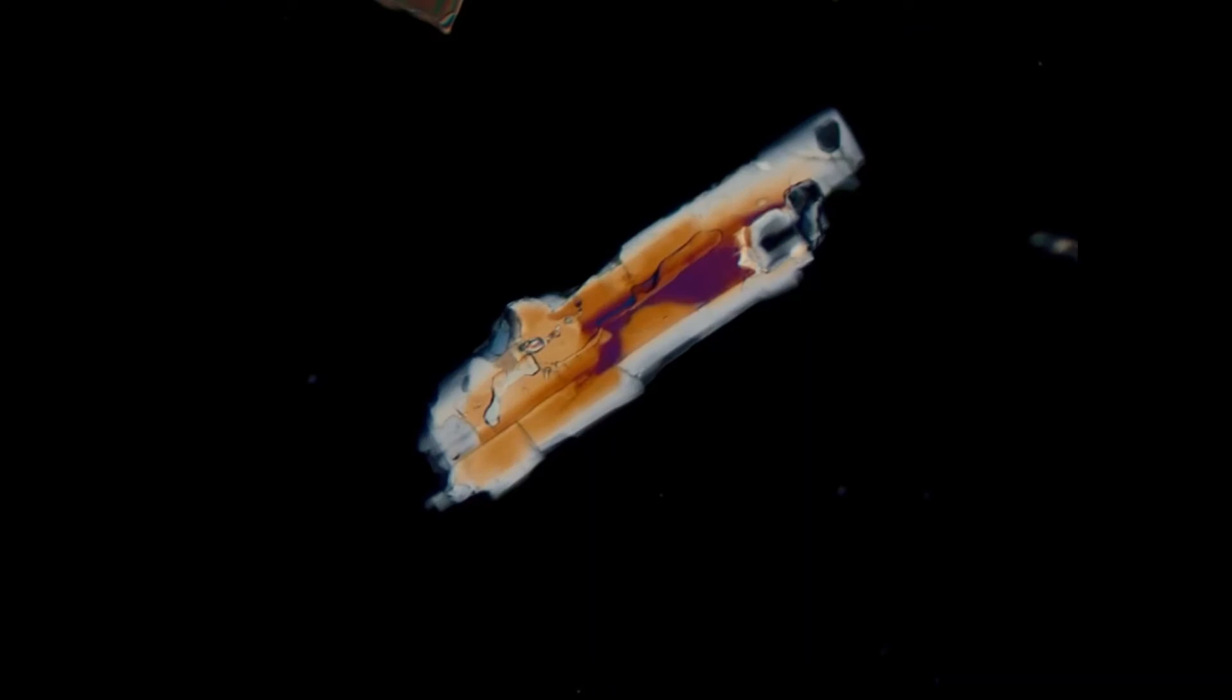If we look at the grain under cross-polarized light, we can see interference colors of the first and second order, depending on the thickness. On the rim where it's thinner, we see first order white and gray. In the center where it's thicker, they range up to the blue of the second order.